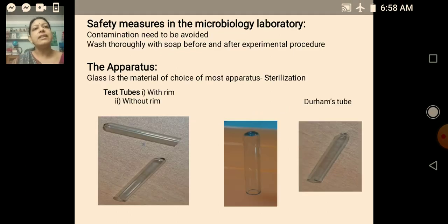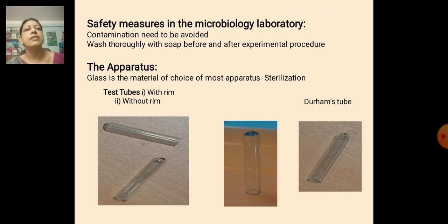When we start with the laboratory of microbiology or any laboratory, we come to the word safety measure. And here in this microbiology lab, apart from fire safety and water safety, there is another term called contamination free zone.